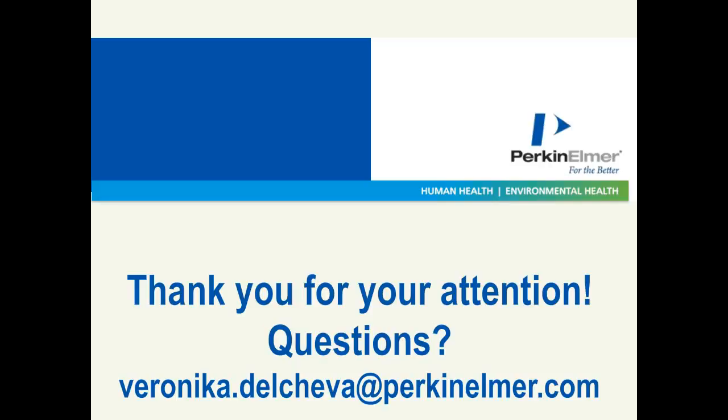So first of all, the first question that I wanted to address was from Eric Reyes at Sigma Aldrich. Hope I got the pronunciation of your name right, Eric. But Eric's question is, I'm assuming that this is directed towards Sandra. Have you been able to compare the NGS results using gel analyzed samples versus the lab chip? Sandra, any comment on that one?